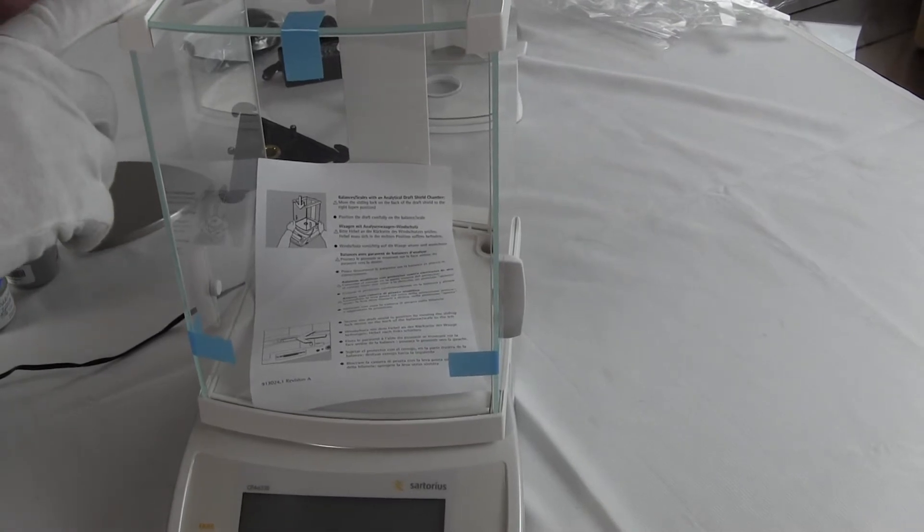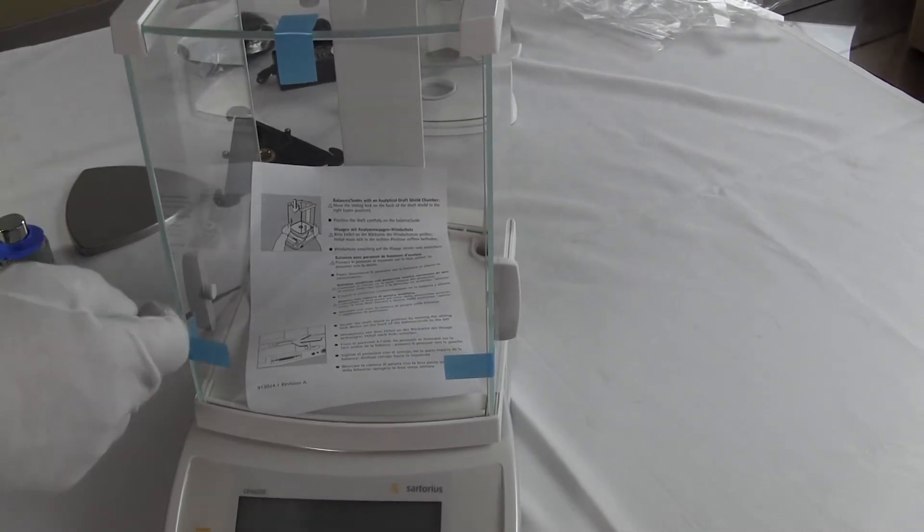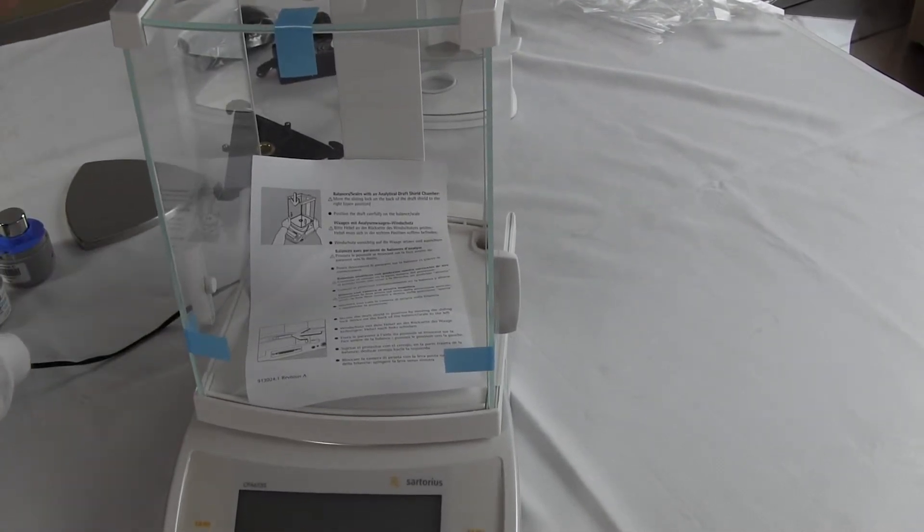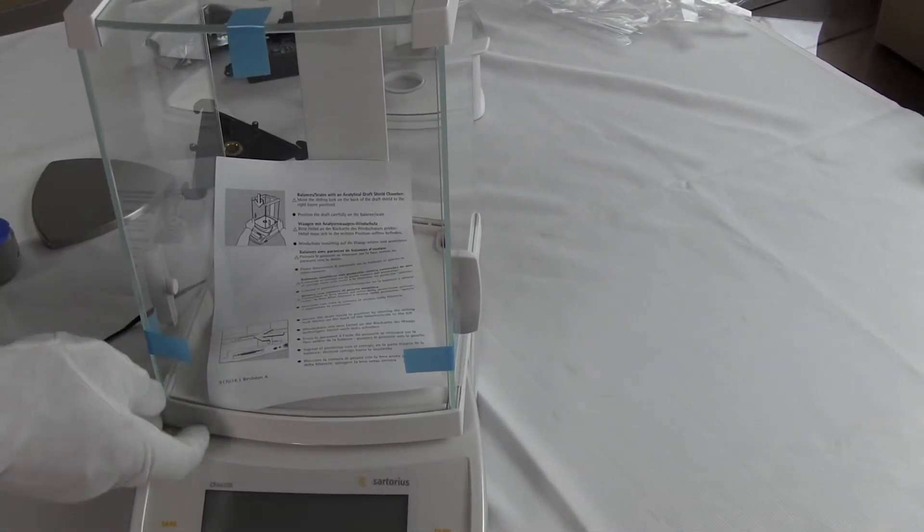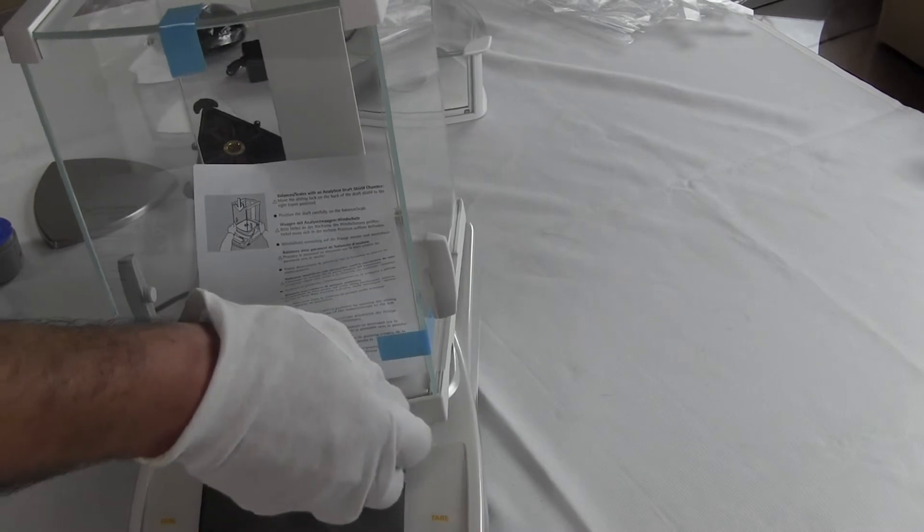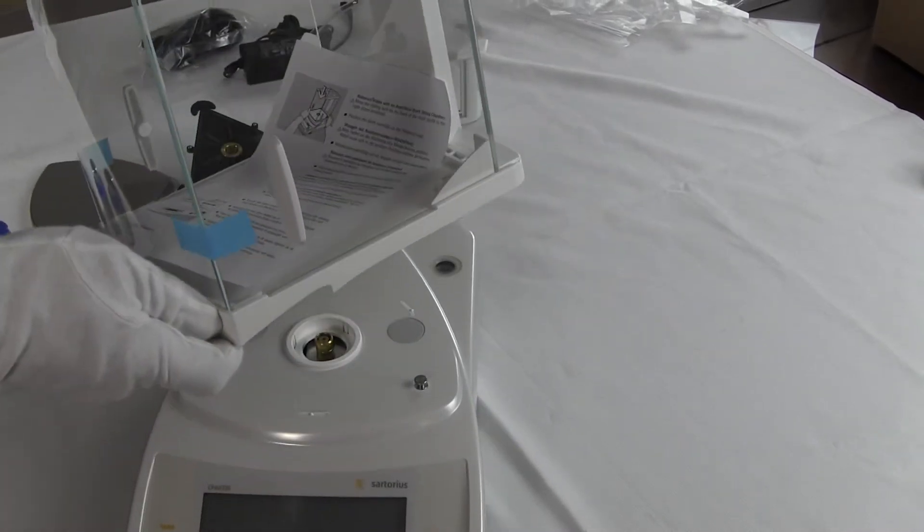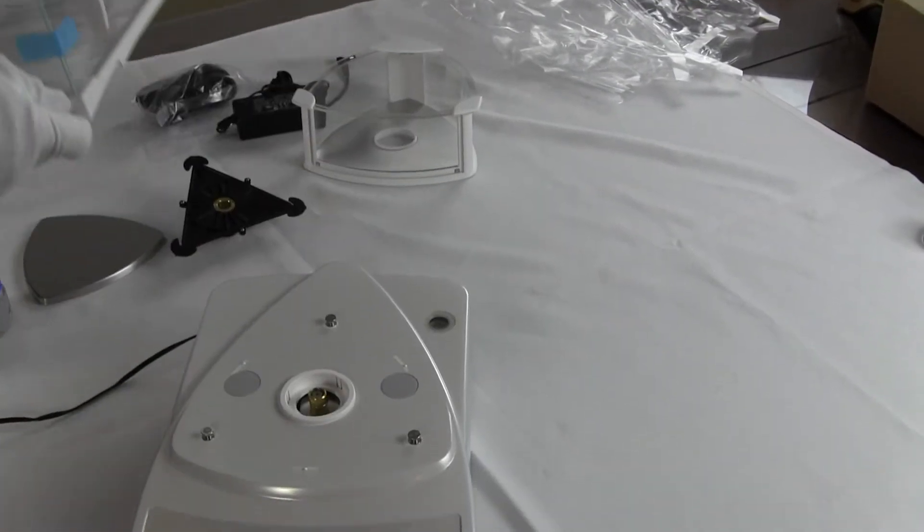We do sell this. It's in the optional accessories. It's about $600. It's pretty expensive. It has anti-static coating on it. You're paying a premium for it because Sartorius really builds the best. That's the glass draft shield. That's an option if you'd like.